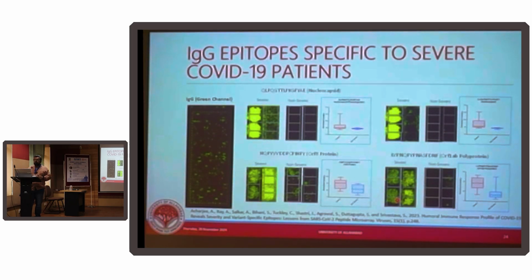So this gives you an idea about how you can use microarray. I told you about different forms of a microarray. So these targets, these are protein targets. We can easily say, if we take this protein target and there is antibody response against this specific peptide, a clinic can usually do an ELISA, right? We can convert it into an ELISA target. A clinic can also run a microarray, but perhaps they don't have a scanner.